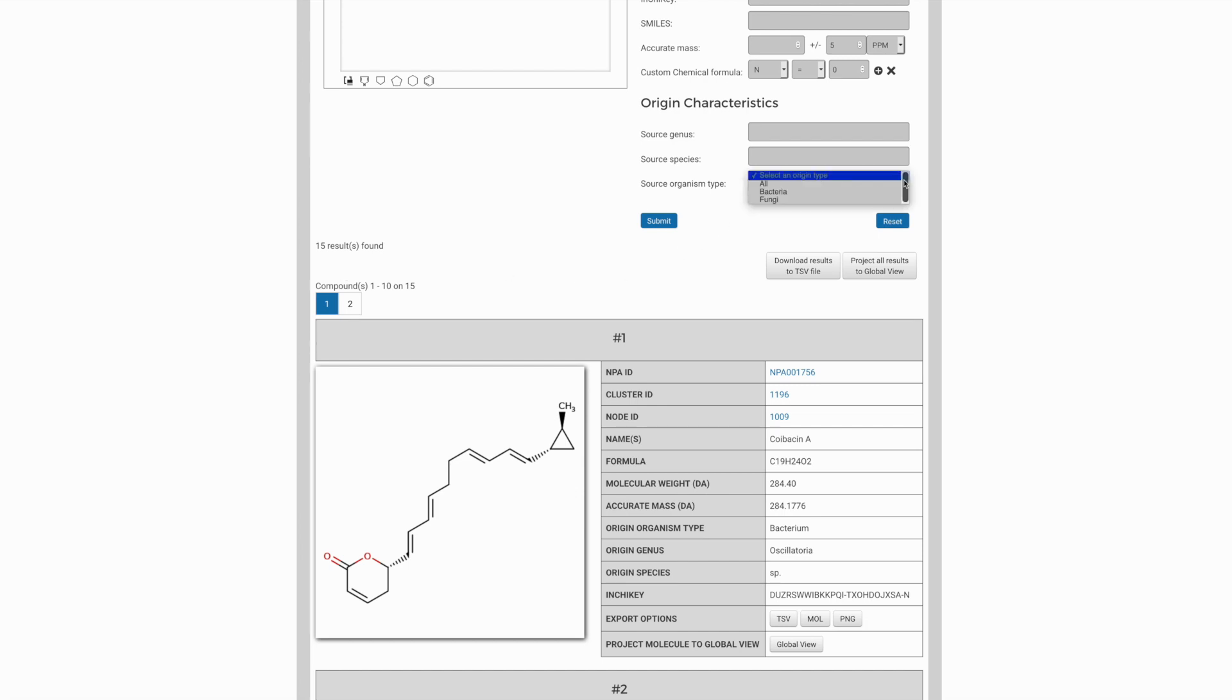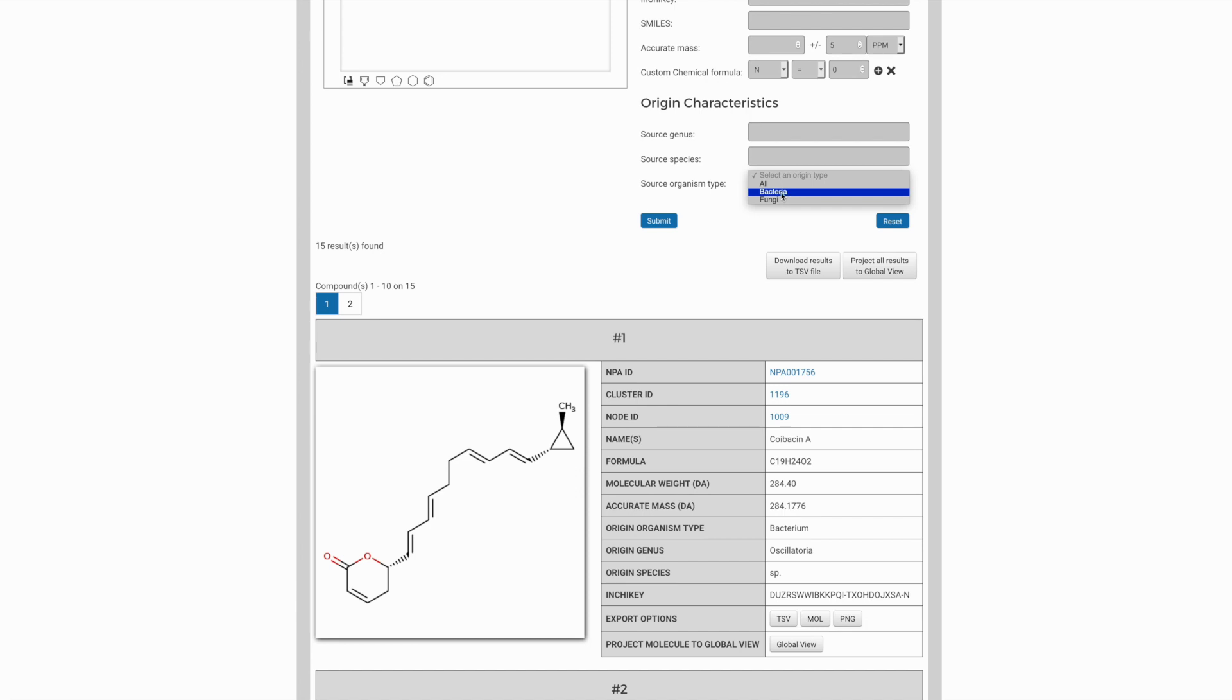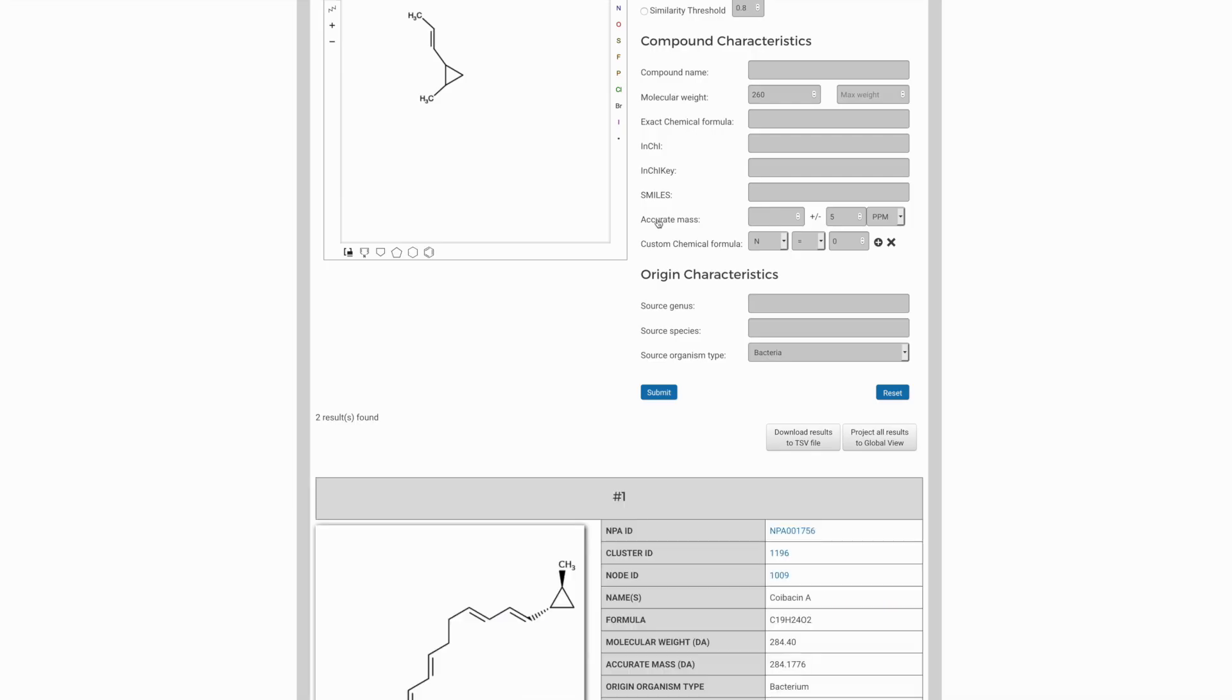In particular, you can use the source organism type filter. We found this to be a very effective way of cutting down the number of candidates very quickly. This cuts the data into chunks based on whether they are bacterial or fungal in origin. So if we choose bacteria as the source organism and resubmit this, the number of possible candidates has been reduced to only two.